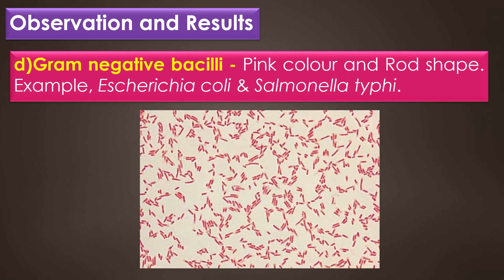Gram negative bacilli appear in pink color and rod shape. Examples for gram negative bacilli include Escherichia coli, Salmonella typhi, Shigella species, Klebsiella pneumoniae, Proteus species, Serratia species, Pseudomonas species, Vibrio species, etc. This image shows the gram negative bacilli.